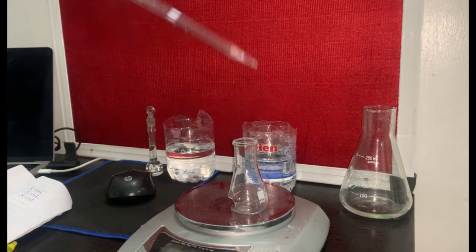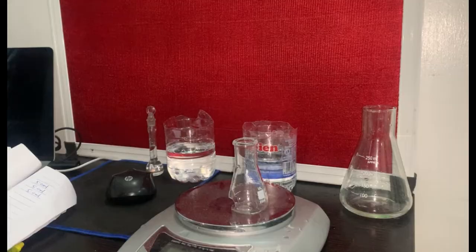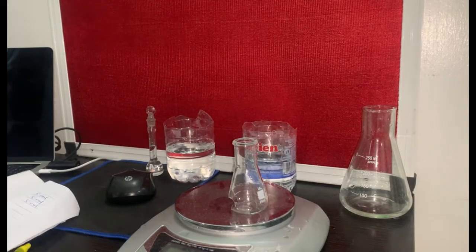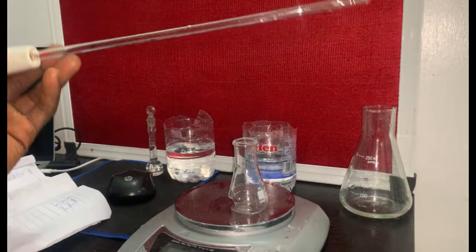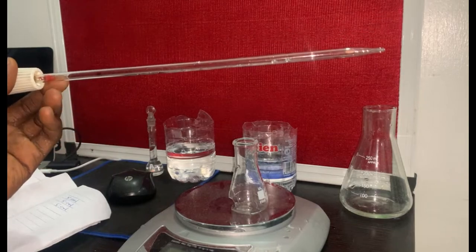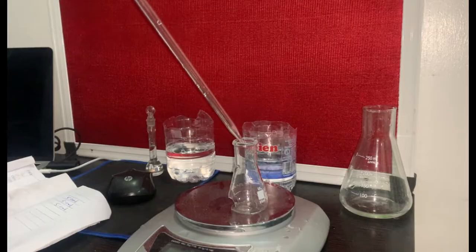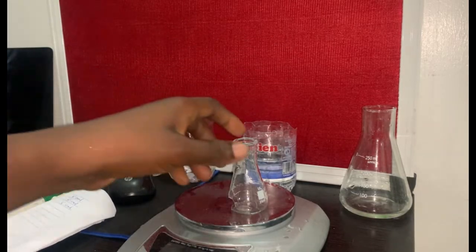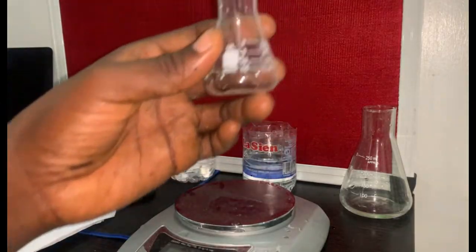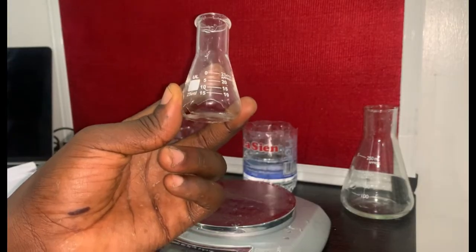I've done this before. So when I took 5 ml of ethanol and dropped it here, what I got was 25.72. That was what I got. I took 5 ml of ethanol, poured it inside this flask and weighed it. I got 25.72. And guess what? That 25.72 is the mass of this flask plus the mass of 5 ml of ethanol. I would have done that 5 times.